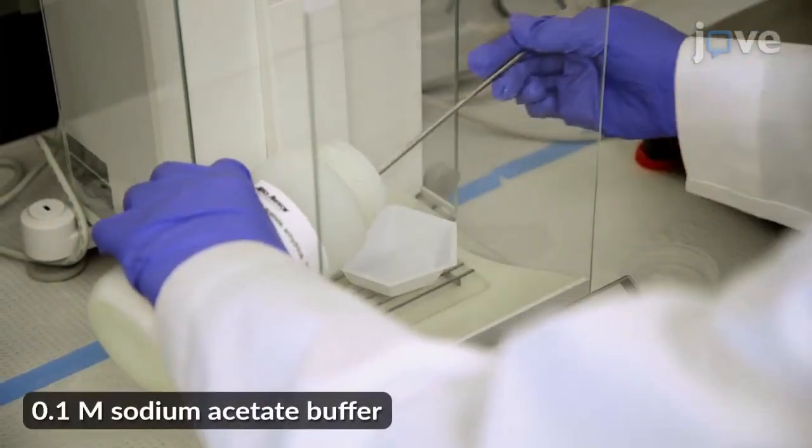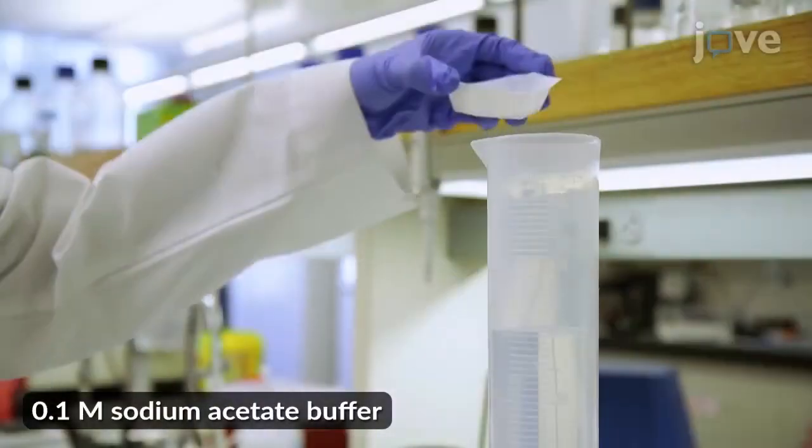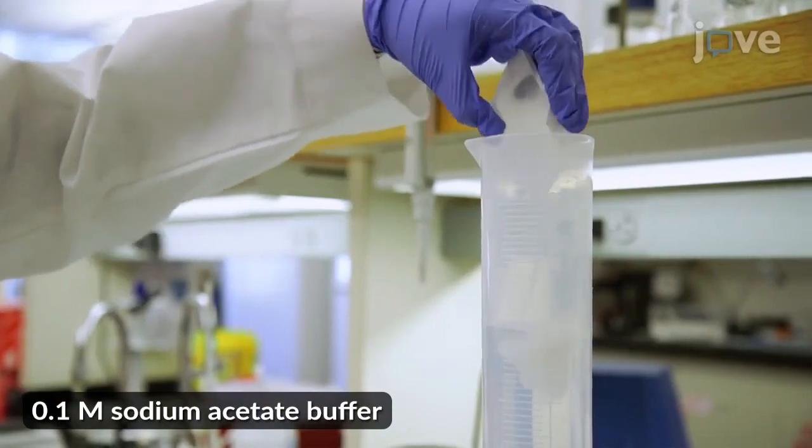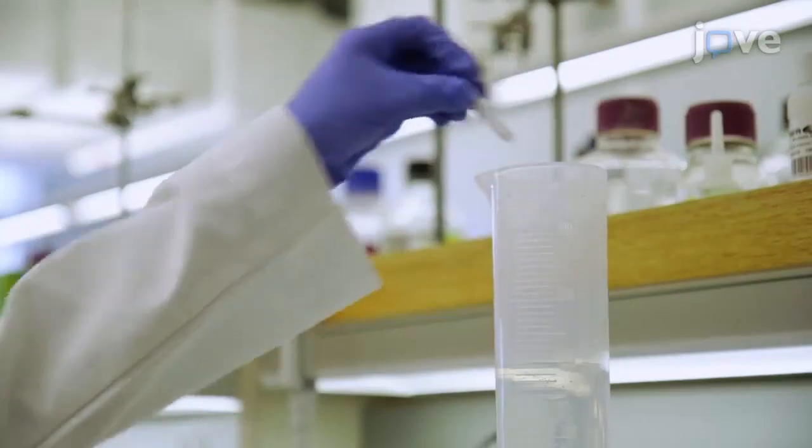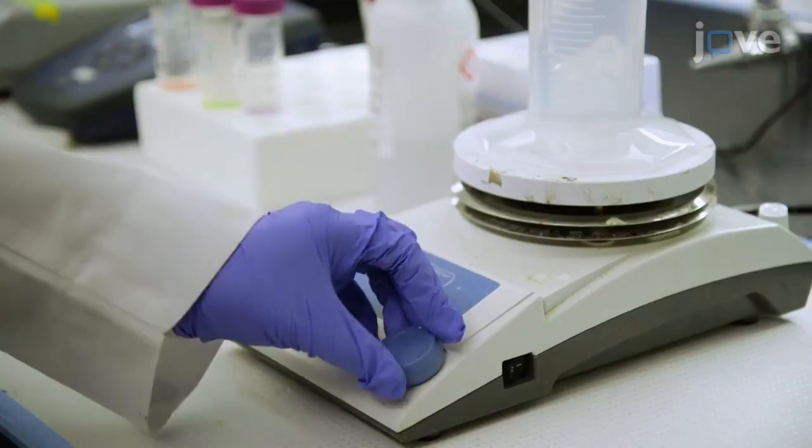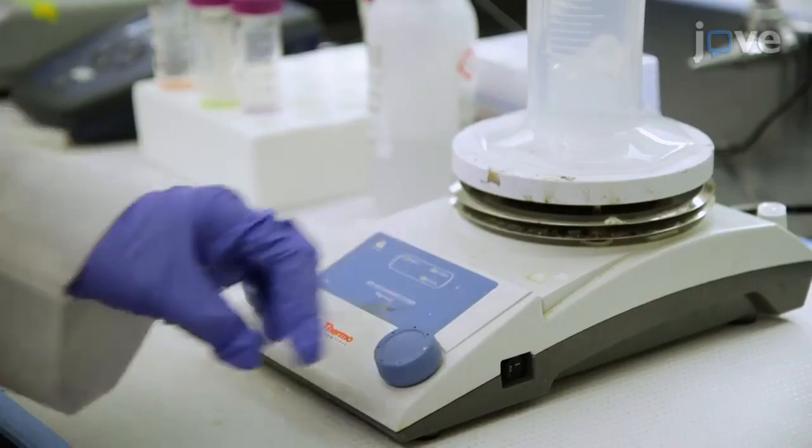Then weigh 8.2 grams of anhydrous sodium acetate and add it to the beaker. Place the beaker on a stir plate, place a stir rod into the beaker, and turn on the stir plate to stir until completely dissolved.